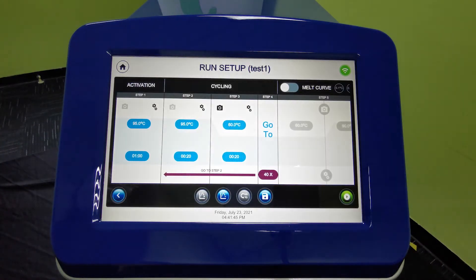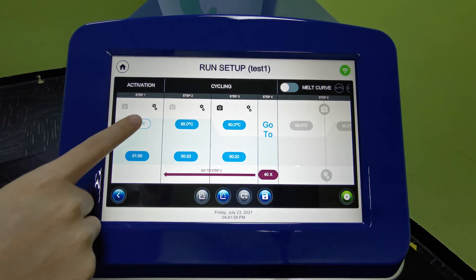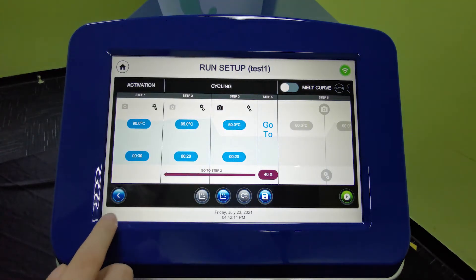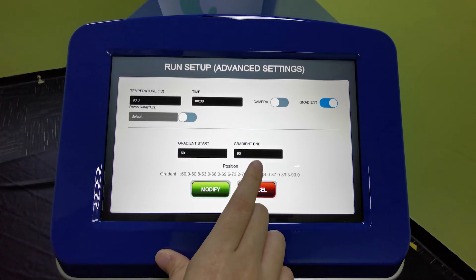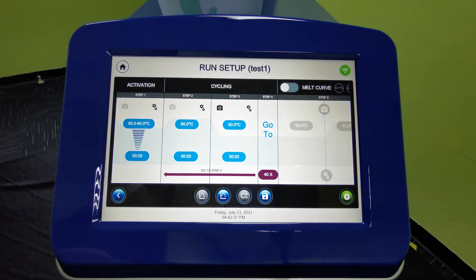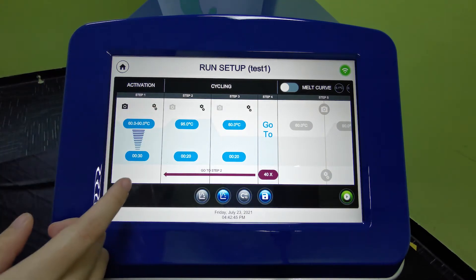Once setup is done, click next to manually configure your protocol. You will see an activation step, cycling step, and melt curve. Under the activation step, click the temperature to edit it — for example, set it to 90°C — then set your timing, such as 30 seconds. If you want a gradient, go to settings, turn on the gradient, and set your start and end temperatures. The system will automatically calculate 12 columns of temperature for the gradient. Once done, click modify and you will see the gradient symbol on the step. The camera button lets you toggle data acquisition for that step.